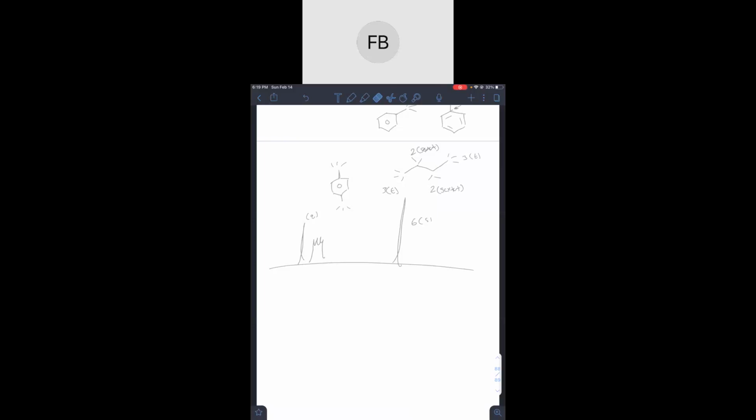So this also tells us there's symmetry in the molecule. You know what I mean? That's something that also lets us know it's para. There's symmetry in this molecule because it has 3 hydrogens here, 3 hydrogens here, and if you think about it, geometrically speaking, each of those hydrogens is exactly the same, right? They're all in the same position on the same molecule.